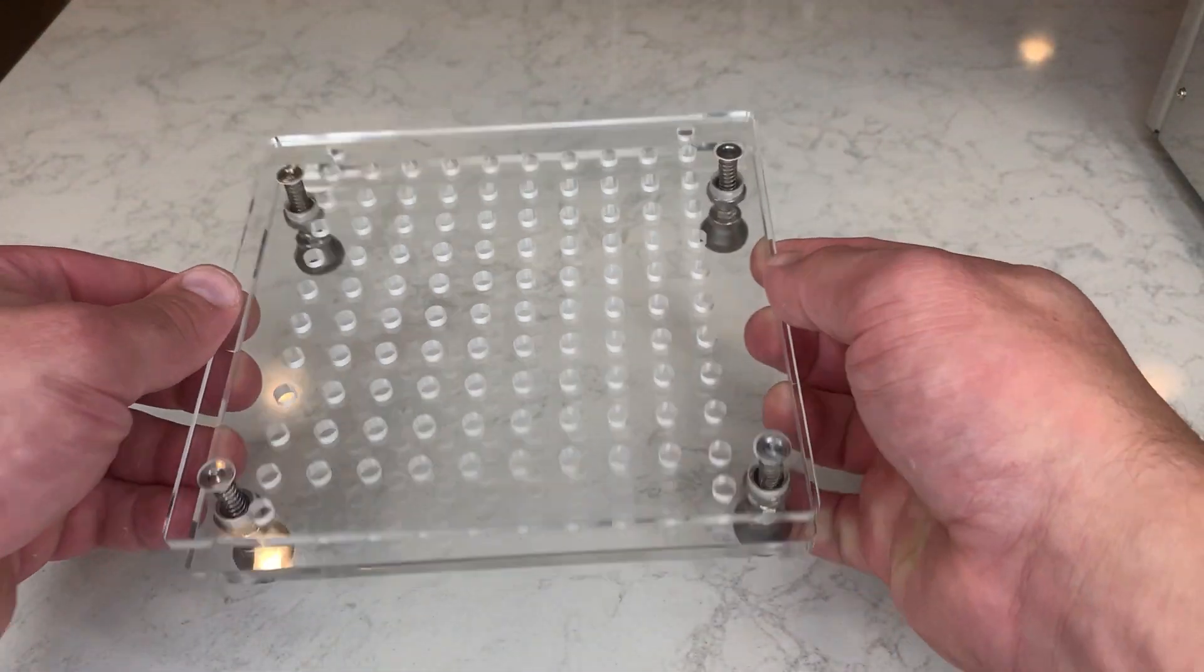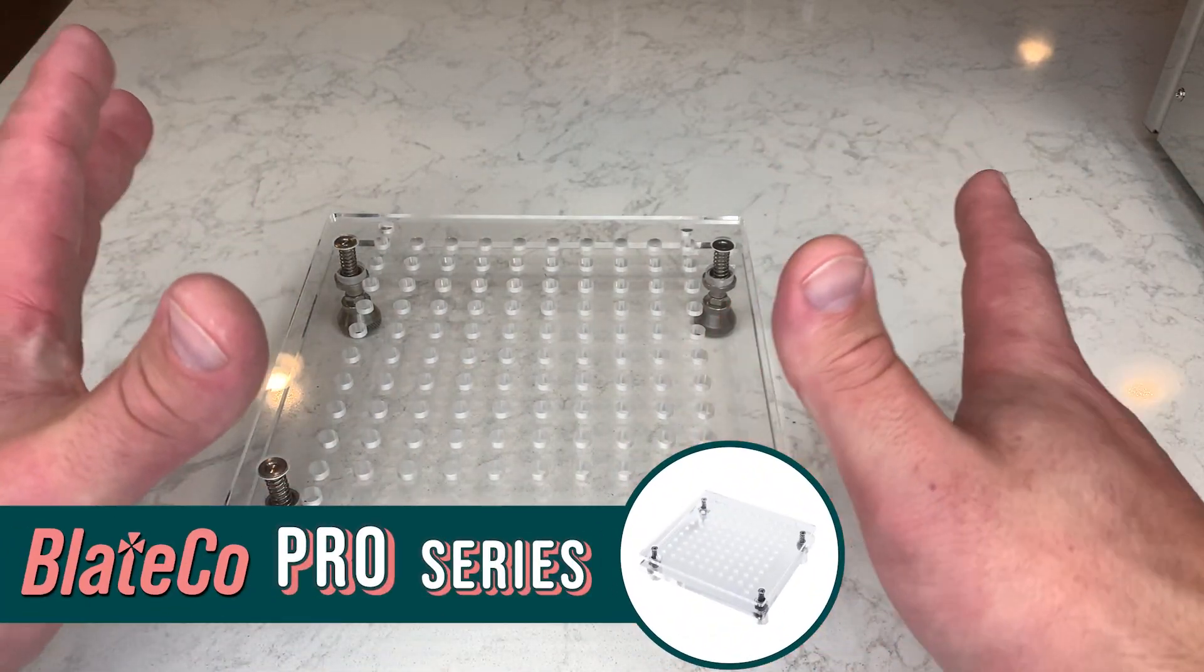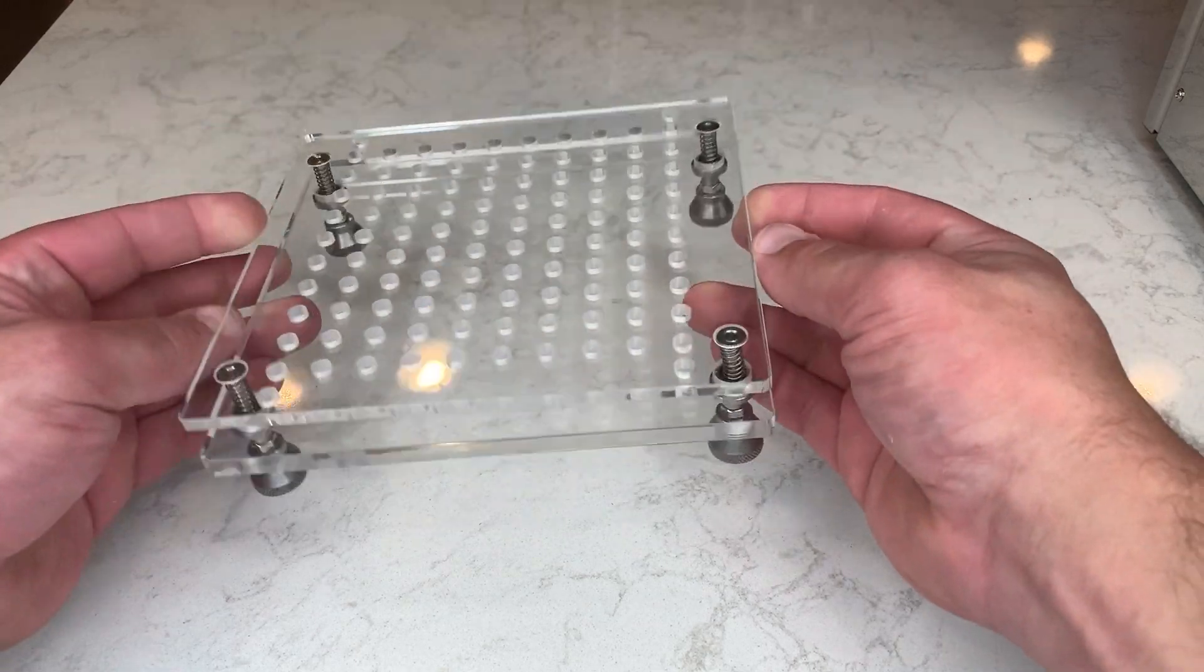Moving on, this is the 100-hole model of our Pro Series line in the newest second generation. You can already see a big difference here, so the transparency of these machines is much more clear.